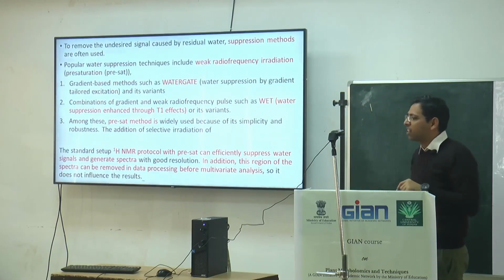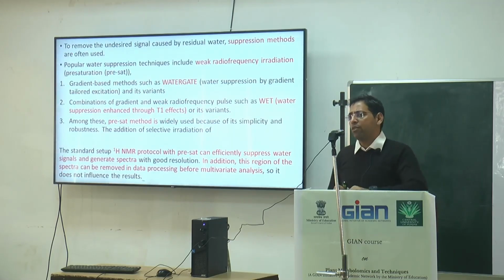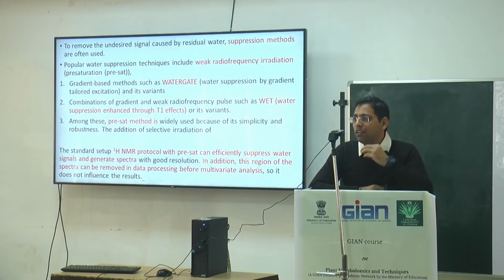Another point that comes up is that the water molecules which are left in the sample were difficult to remove, as I told you, because they are associated with the carbohydrates, bound with the amino sugars. So yes, water molecules are present even in your sample when you extract it.